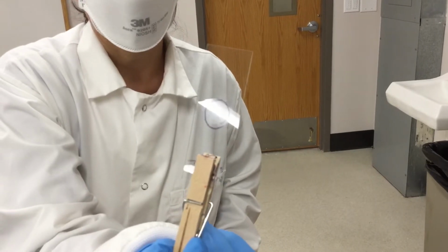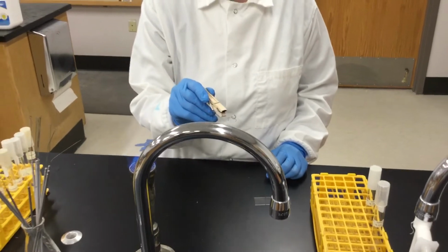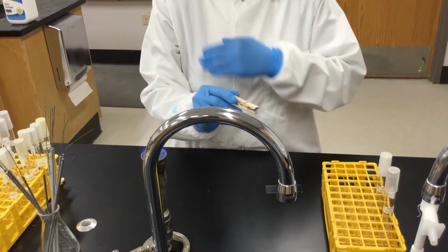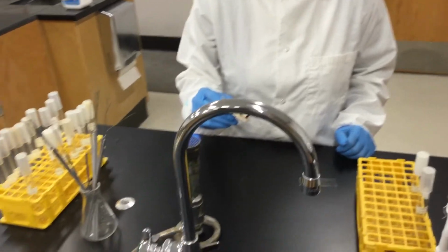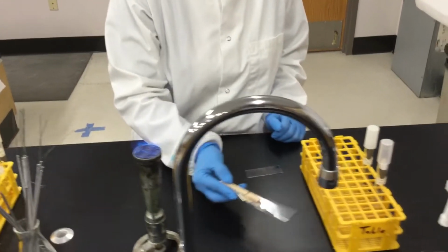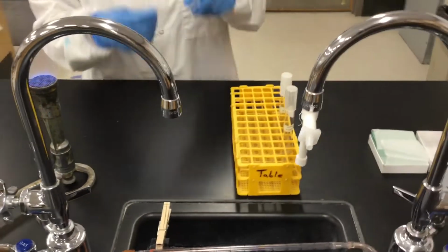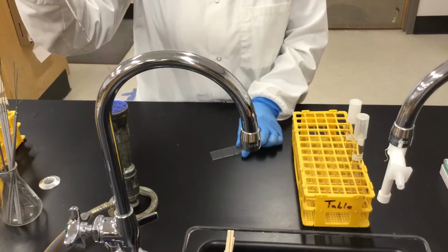So this is a smear that has dried, and you have to heat fix the bacteria. You will attach the bacterial cells to the surface of the slide when you are heat fixing it, and you kill them at the same time. So I'm going to do that really quick. 1, 2, 3, and that's it. And then you put it in here, and then you start your staining technique. But let's first do this other one for the solid media.